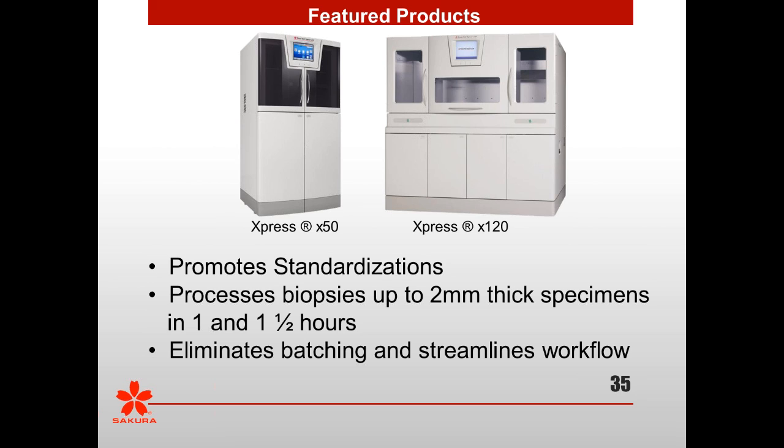But we have chosen to use the pre-processing solution, PPS. Yes, pre-processing. PPS. Correct. But it is mainly an isopropyl solution.